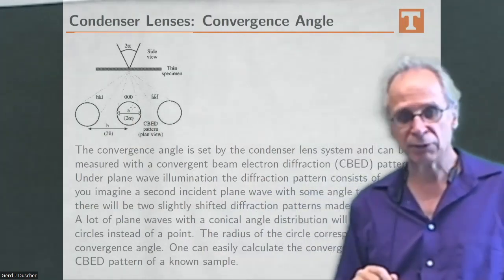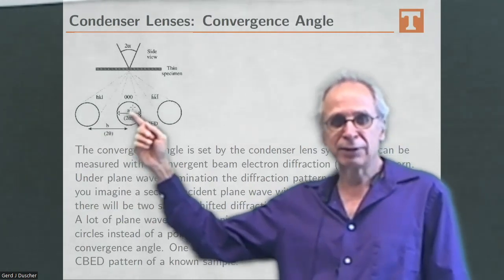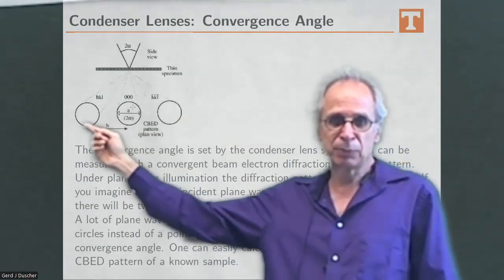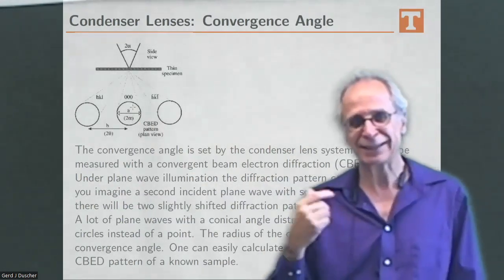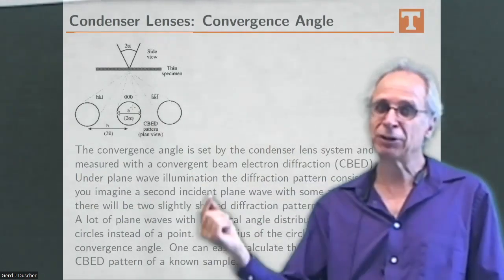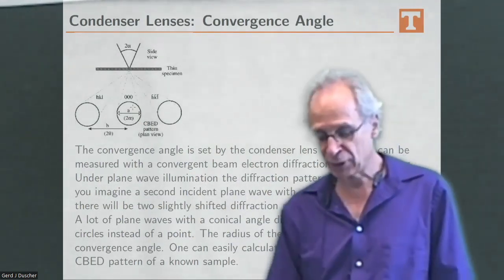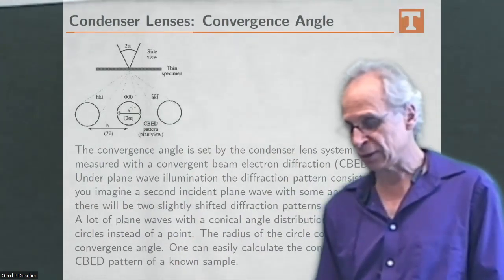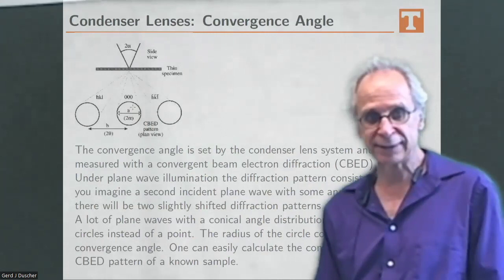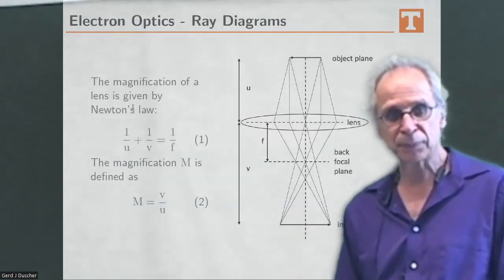There's no difference whatsoever. In the dynamic case, we have a large difference, because here we actually have a map of the excitation error. That is something we are going to learn in diffraction and look more into, because it is the most precise diffraction technique out there, and so we can utilize that, and we will utilize that in 4D STEM.